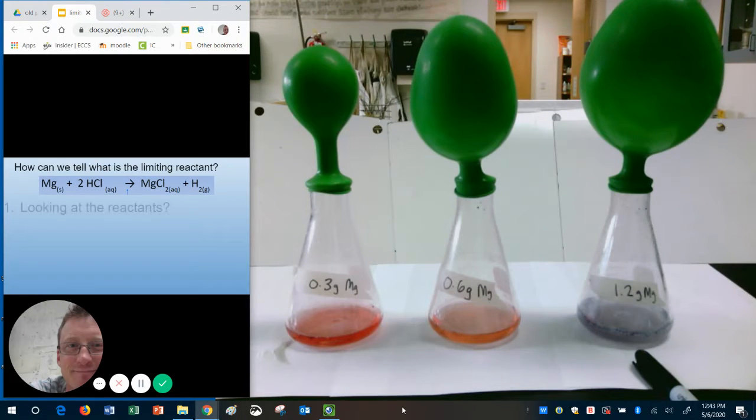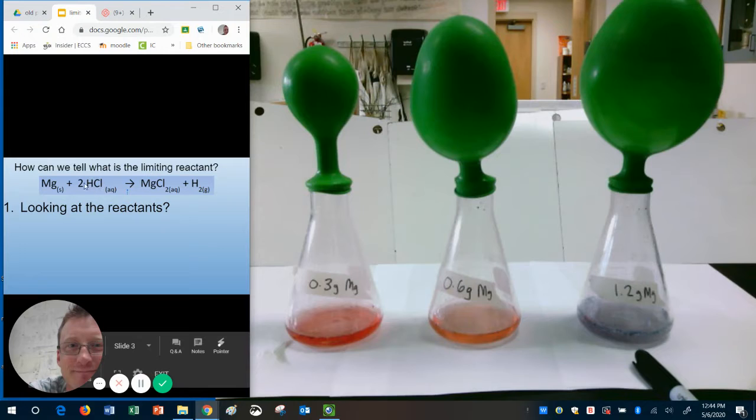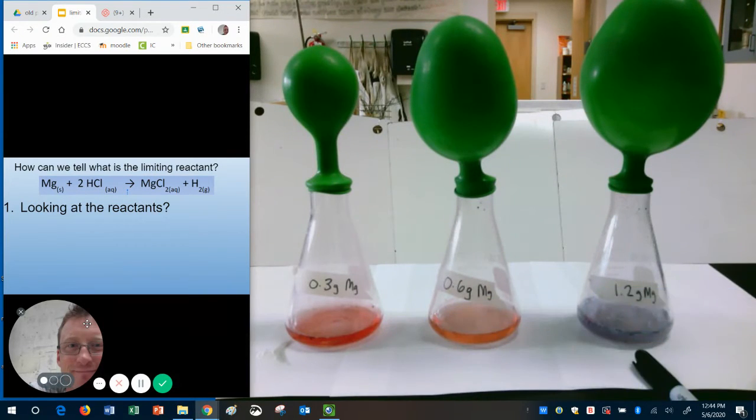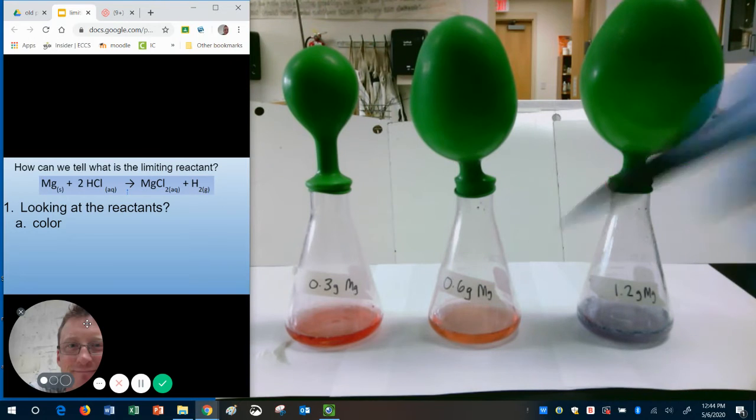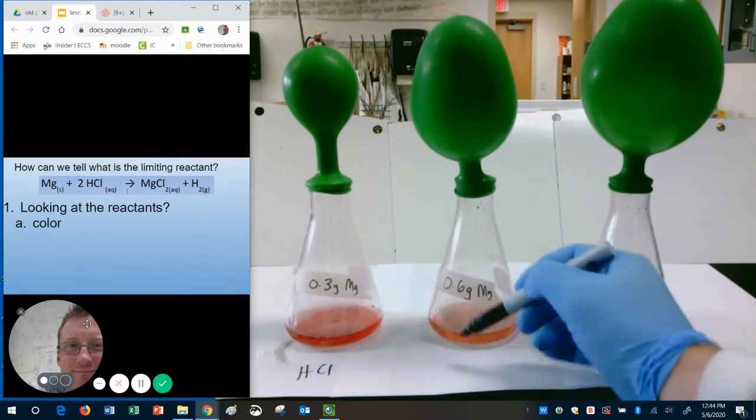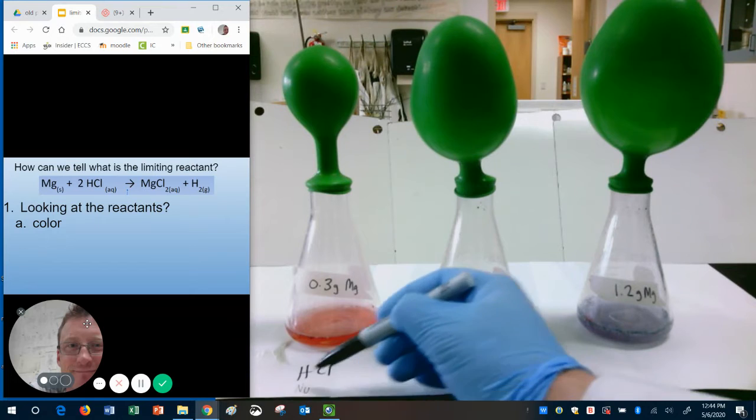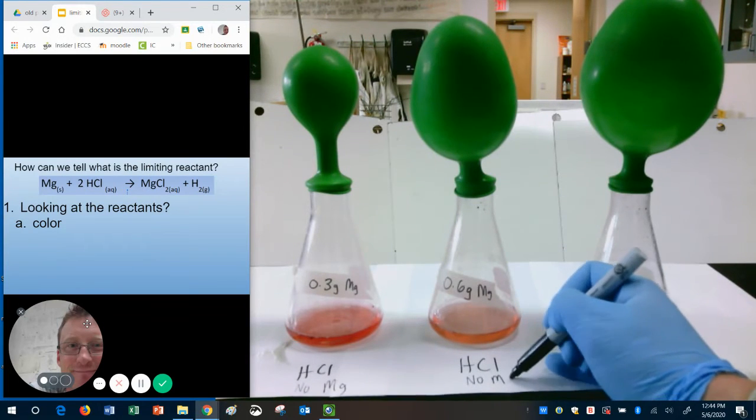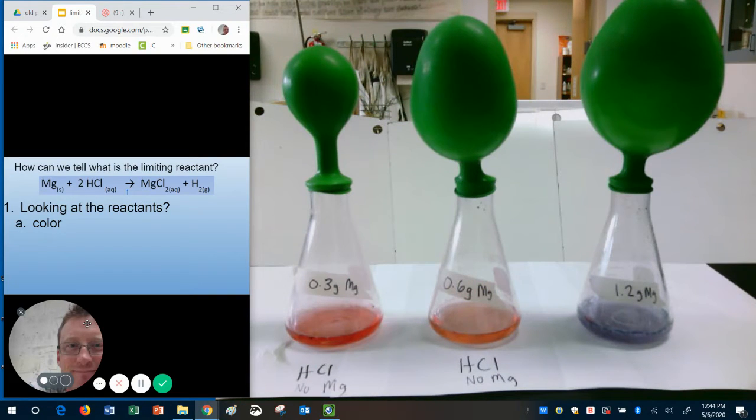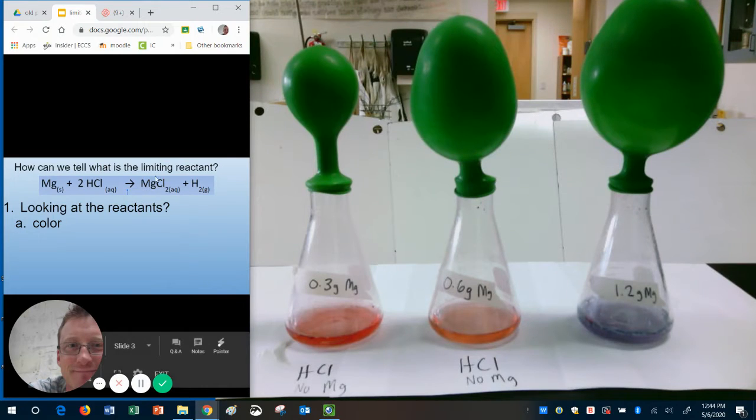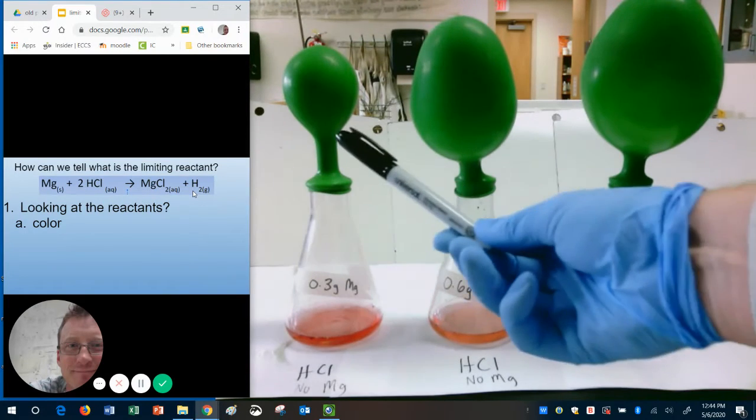How can we tell what is the limiting reactant? When we look at the reactant side, if there is HCl left over in our containers, it should be pink. So which ones have HCl? The first one must have HCl in it, and the second one must also have HCl in it. What must have run out? There must no longer be any magnesium powder in either of those. Why? Because they turned into their products. We created magnesium chloride, which is colorless, and we created hydrogen gas. That's why the balloons inflated.